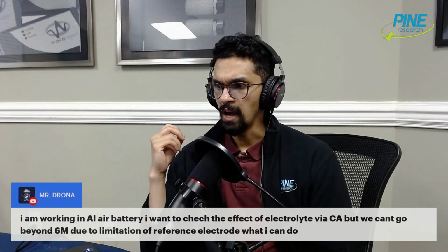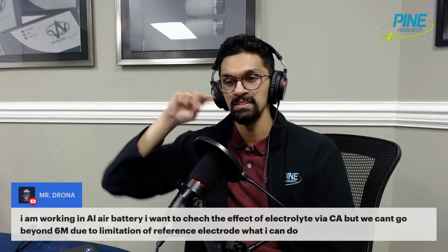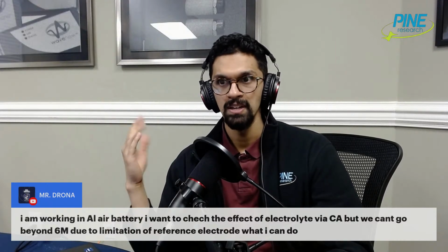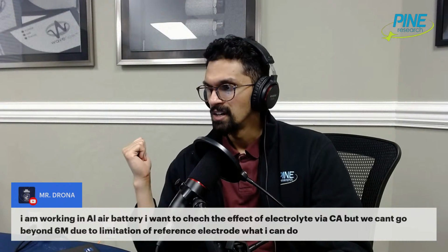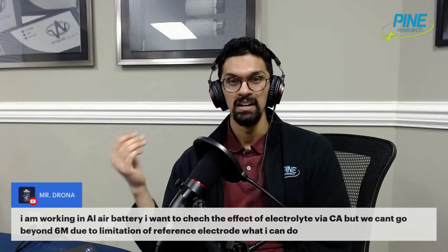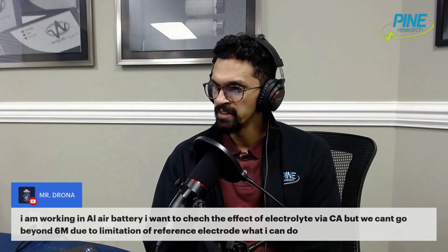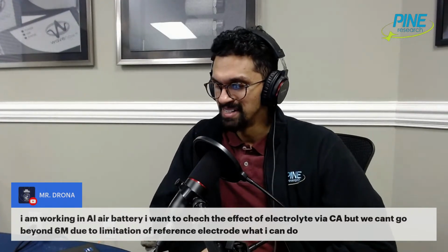Well, I would do a very quick cyclic voltammetry experiment to see, hey, that redox species that I have in my system, is that redox peak shifting around, right? Is that peak actually shifting around? But for chronoamperometry, interestingly enough, all you need to do, generally speaking, is just apply a sufficiently high or a sufficiently low potential, and then watch the current decay. You are working with a battery, so I don't know. Chronoamperometry, I think, is a little bit different because you are, in a way, charging the battery.